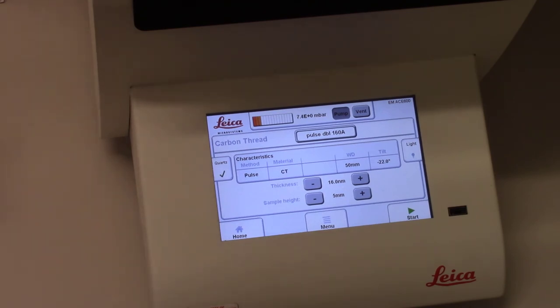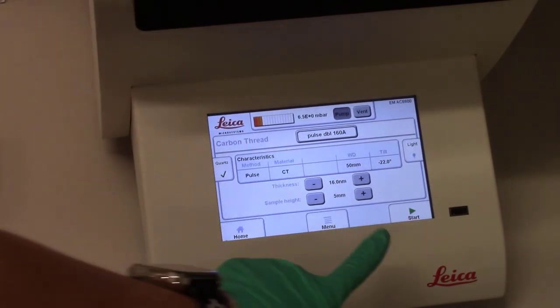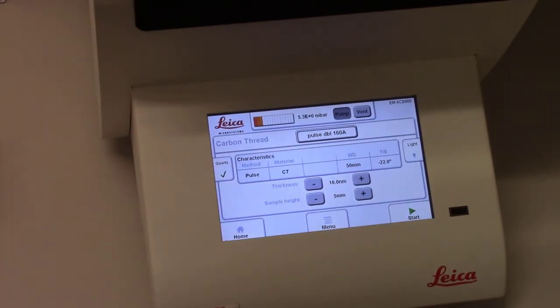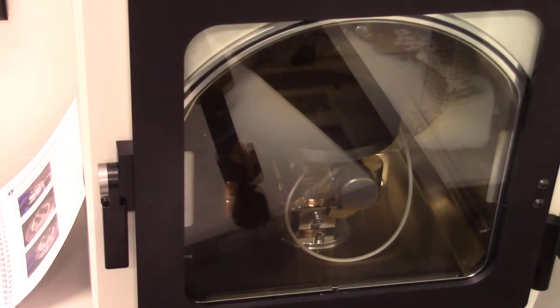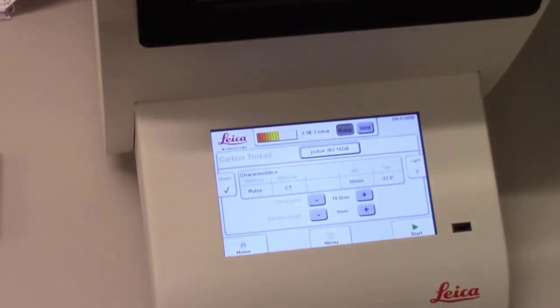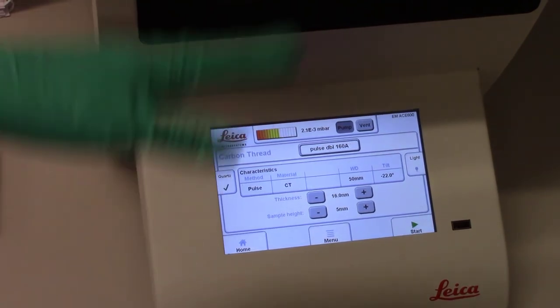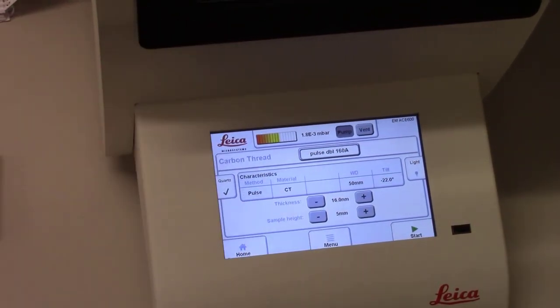And then you have to just wait a long time, especially the first time you pump it down. It needs to be pretty low. In fact, ideally it's somewhere around 2 times 10 to the negative 5 millibars. So it's like 1 right now. So it's going to take a while to pump this down. You have to be patient. And then when you're ready to start, when the pressure is down to where it should be, there's a little start button here. I don't think it will let you carbon coat unless the pressure is low enough. But please just be careful. Don't try to carbon coat when the pressure is too high. It needs the vacuum to make the carbon coat the correct consistency. You're going to wait for that and then you just push start and then it will actually make little arcs. So you can see it kind of sputtering as you go. And it will also show on the screen down here its progress as it's testing the different carbon threads and then vaporizing each in turn.